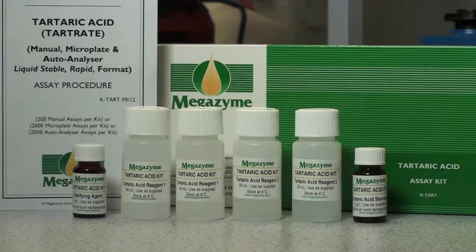The kit as received should contain one instruction manual, one bottle of clarifying agent, two bottles of Tartaric Acid Reagent 1, two bottles of Tartaric Acid Reagent 2, and one bottle of Tartaric Acid Standard. The reagents are used as supplied.